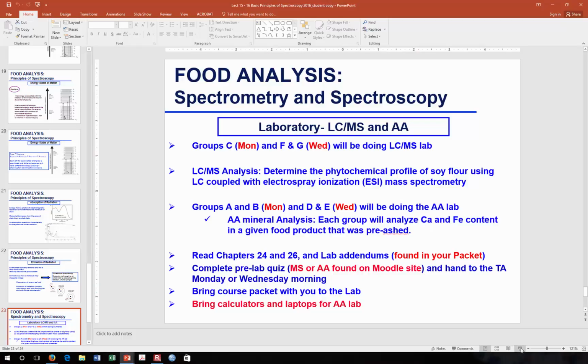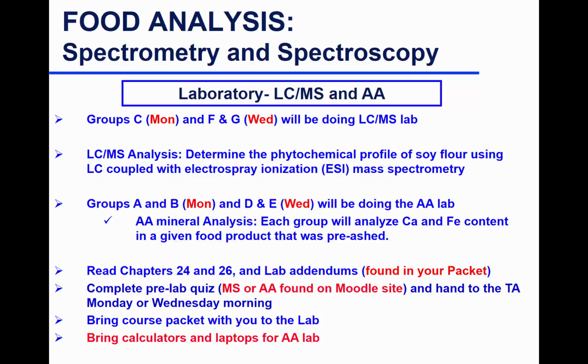I will send my regular weekly reminder, but next week is again rotational lab, so some groups will be doing atomic absorption, another set of groups will be doing mass spectrometry. So groups C, F and G will be doing LC-MS, and all of you in the past couple of weeks got a glimpse of what you're going to be doing with the LC-MS. Remember the chromatogram of isoflavones that I showed you? We're going to carry it a step further and do identification work with MS.